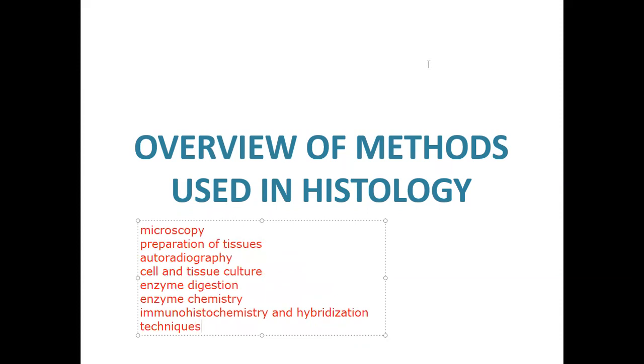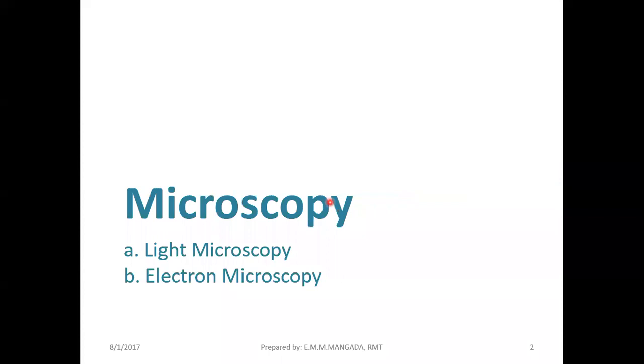So to start with our discussion, let's begin with microscopy. So guys, of course, the most important tool that we are using in studying tissues, especially for us medical laboratory technicians or technologists, is really important. And of course, that is our microscope.